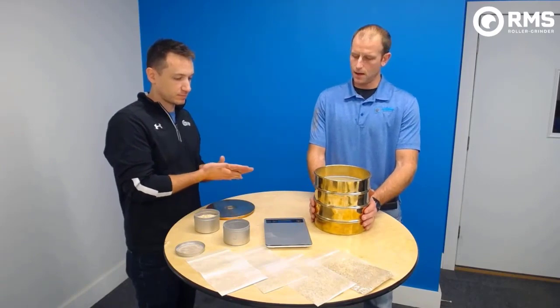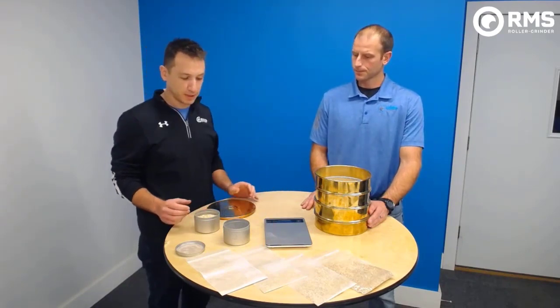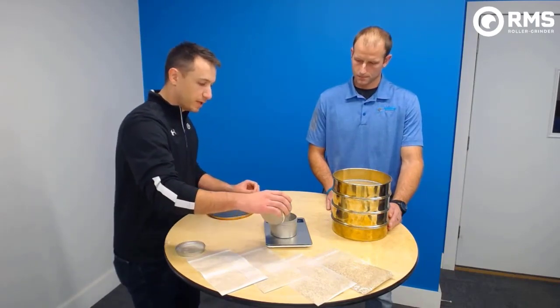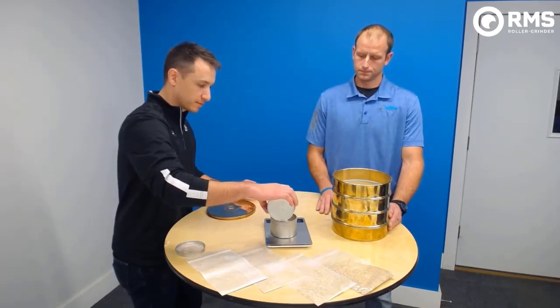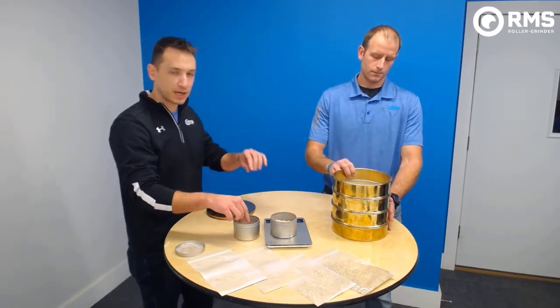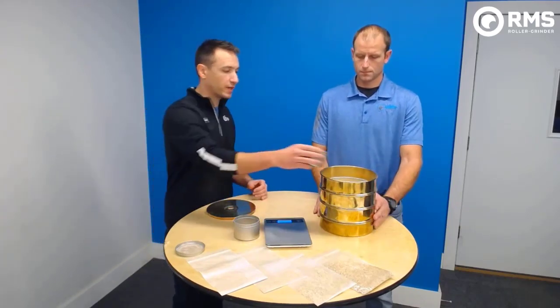Walk us through the steps of how to actually do a grist analysis. You'll need your sieve set, a scale that measures in grams, a container, and your sample pulled from your mill. The first thing you do is zero out your scale and then take your sample and measure out 100 grams — you're looking for 100 grams in the sample. Once you get to 100 grams, make sure you have the dry, empty weight of your pan and your three sieves. Weigh those ahead of time, write out the empty weight, and then take your 100-gram sample and pour it into the top of your sieve set.